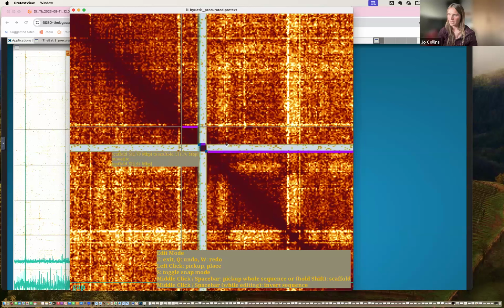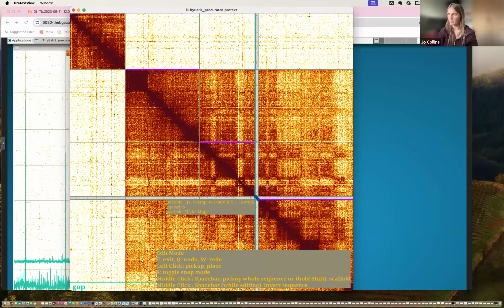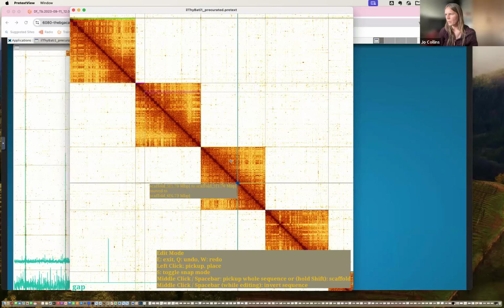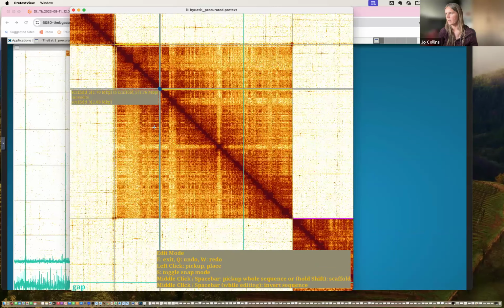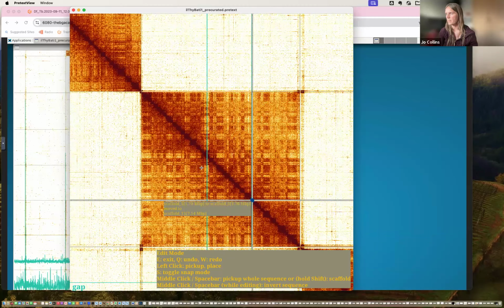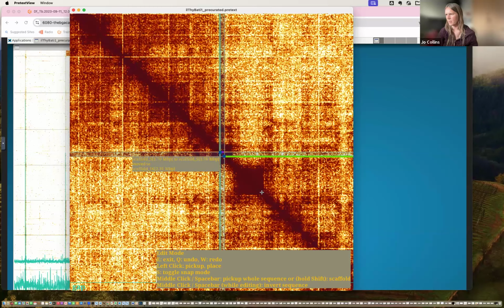and then we have to press S to get it to move out, and then we've picked up that piece. Then you can scroll over, as you have been doing, using your right mouse button to scroll. We'll scroll over to the right chromosome, and it looks like it's part of here.